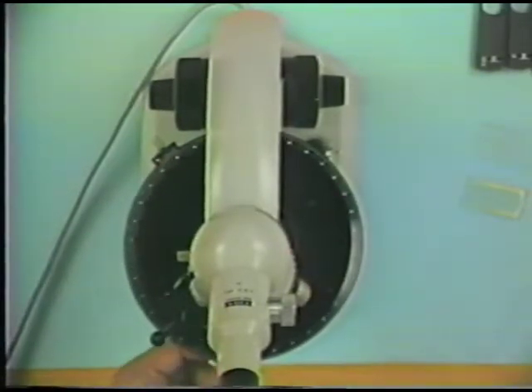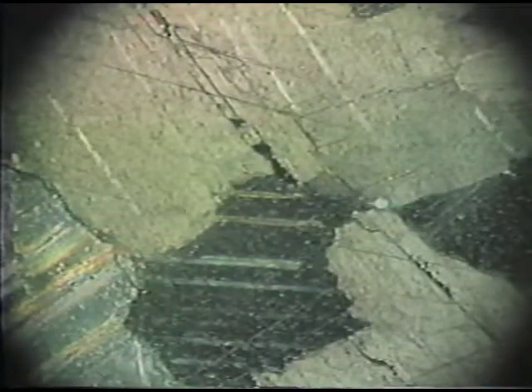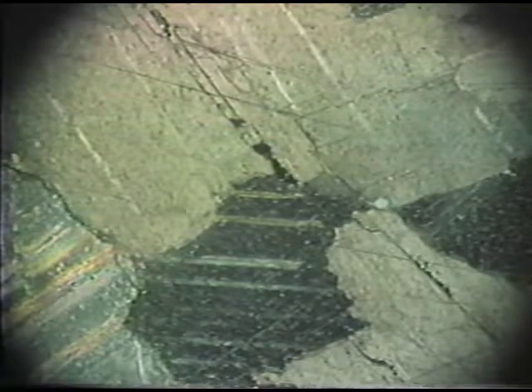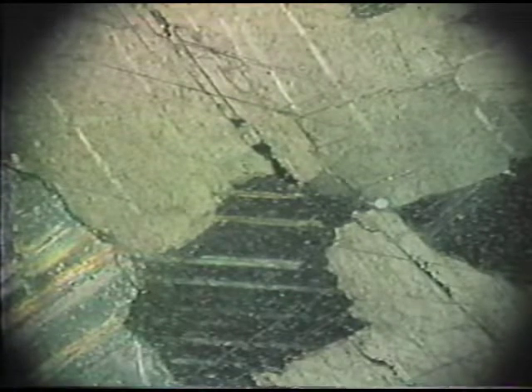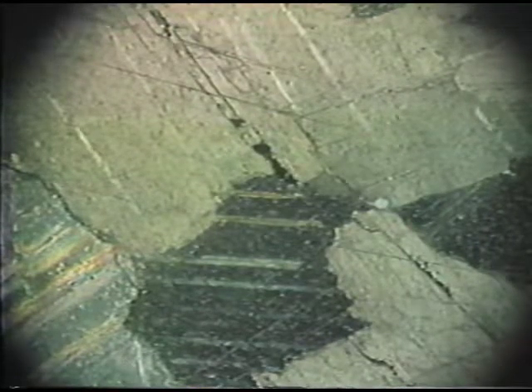In this carbonate rock, calcite shows iridescent, very strong birefringence, equivalent to greater than 0.1. There are rare kinds of minerals, for example, rutile, which show birefringence that's still higher, what we call extreme birefringence of 0.2 and higher. Extreme birefringence is rare and restricted to only a few particular kinds of minerals, rutile being an example.